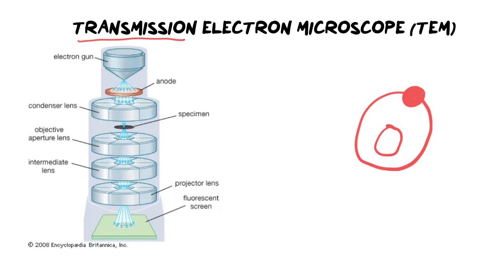Those are the small subatomic particles that we are going to use. What we do is shoot them with an electron gun, which I know sounds very exciting. But you've actually seen an electron gun in use before, because we find them in televisions. We use electron guns to create the images that we see on TV.